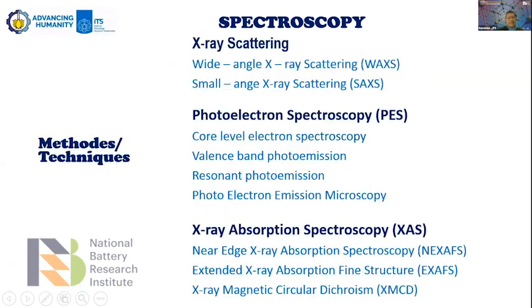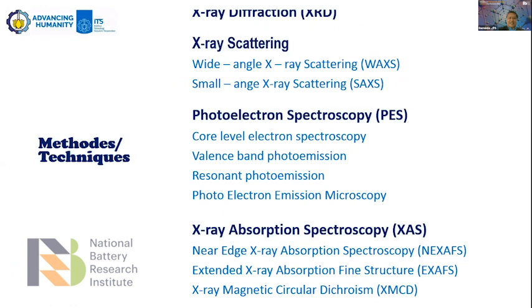Okay, so some methods relating to X-rays. There is WAXS, wide angle X-ray scattering. It's the opposite of SAXS, small angle X-ray scattering. And this is photoelectron spectroscopy and X-ray absorption spectroscopy. Okay.